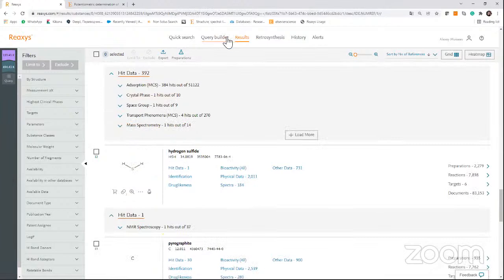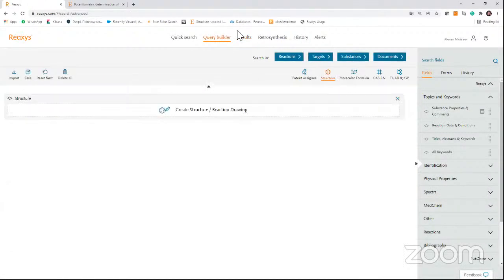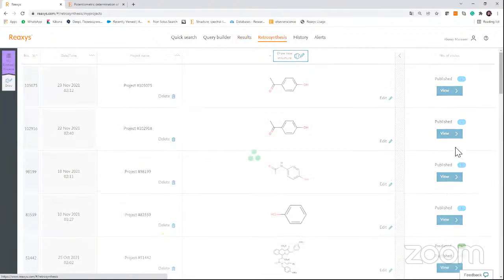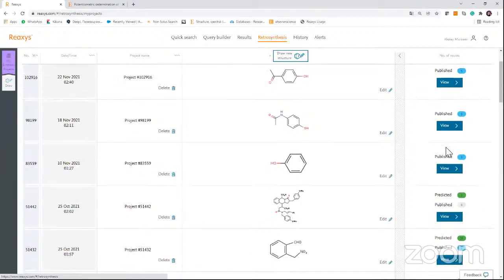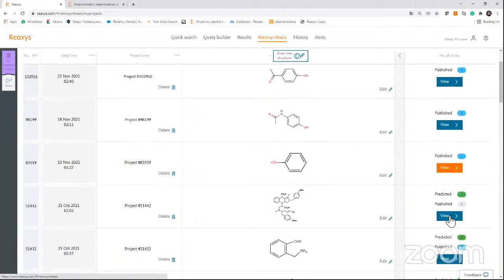For any compound that we are working with, if we are doing retrosynthesis, we have two ways of working with the chemical synthesis. For example, we can work with reactions that were already published, but also predicted.